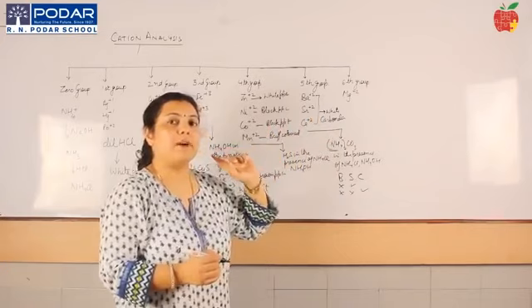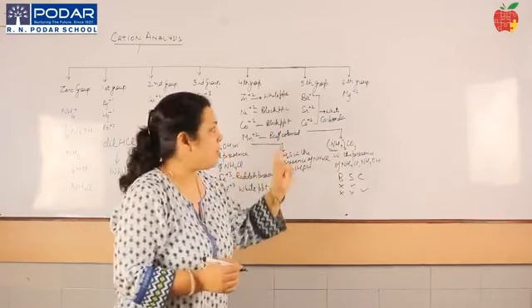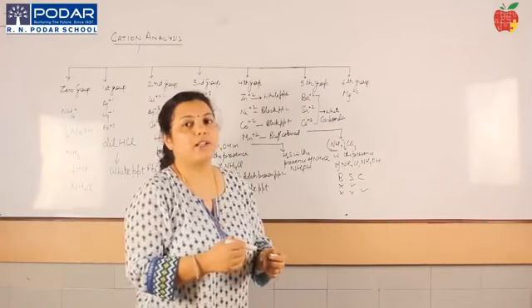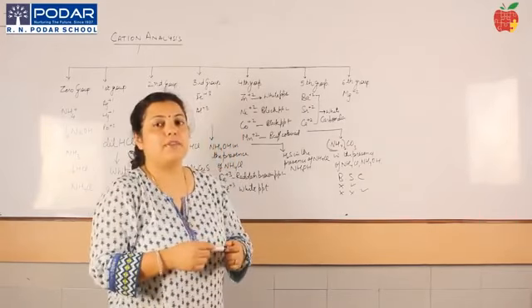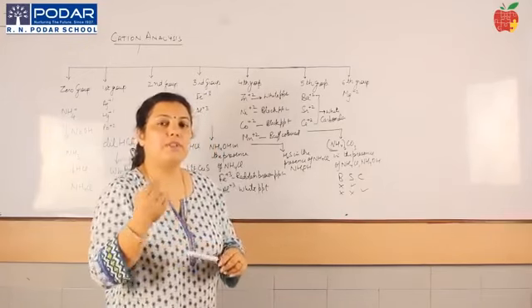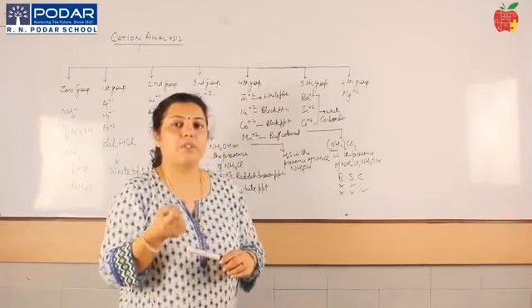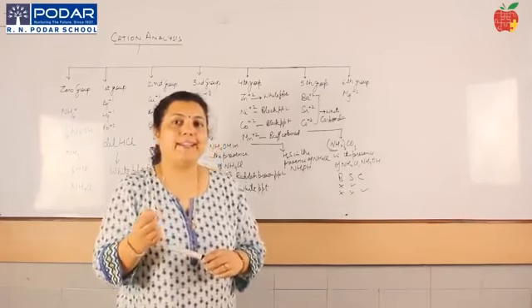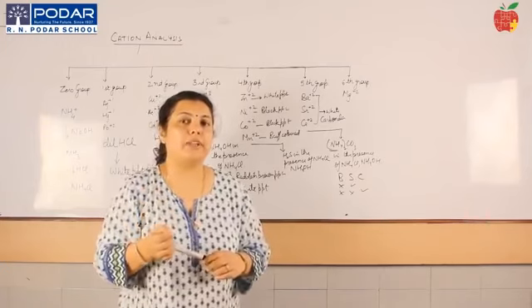Now one more way by which you can have an indication of the kind of cation which is there, whether it's barium or strontium or calcium, is to do a flame test when you do the preliminary observation. In the flame test, you will make a paste of salt with concentrated HCl, take it on a platinum loop, and then put that paste into the flame.